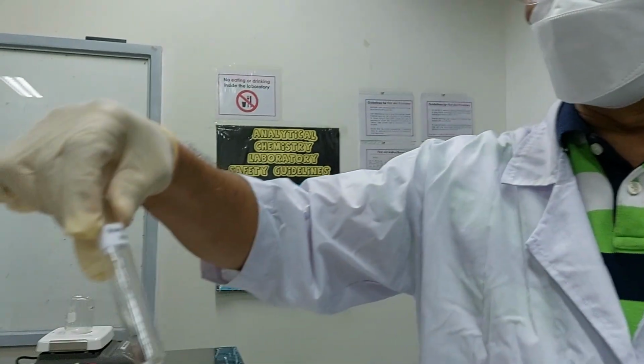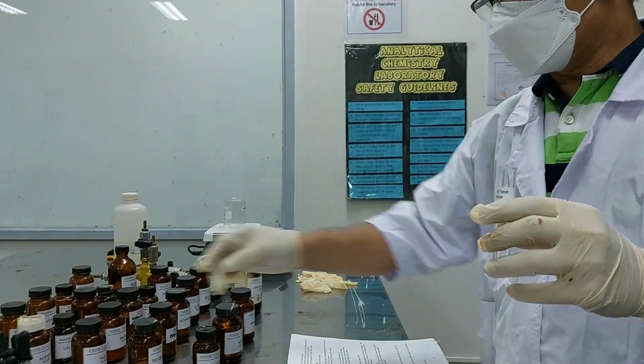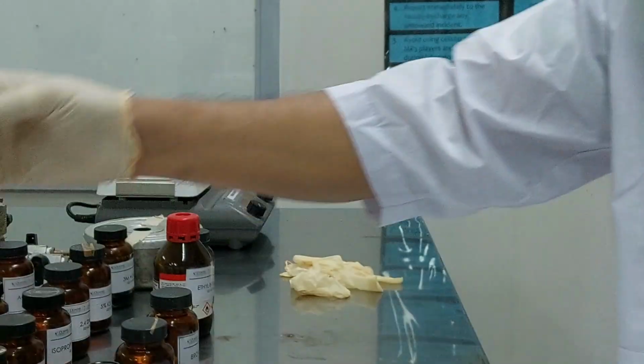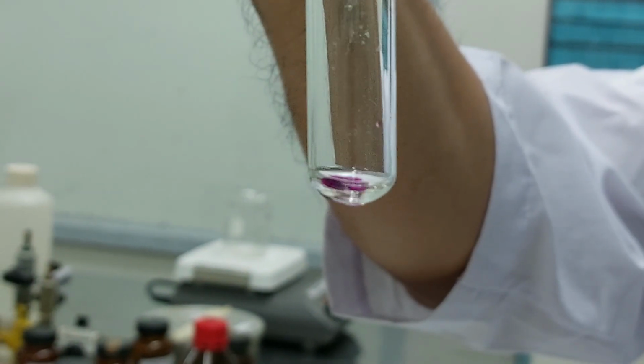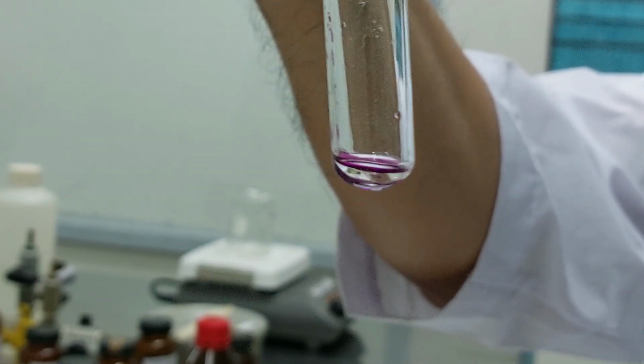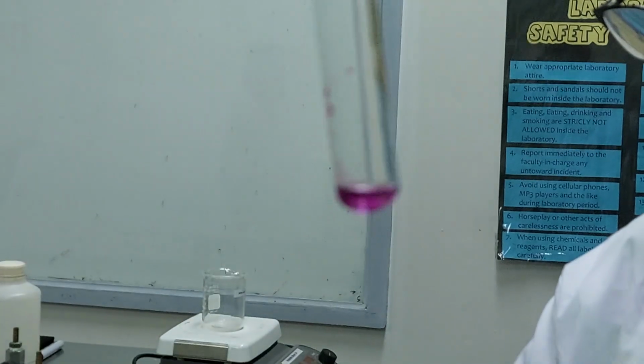So now let's see for hexane, which represents alkane, and benzene for aromatic. So this is hexane, okay? And we're going to place a few drops of hexane and observe, no? 1, 2, 3. See? You still have that violet color, okay?